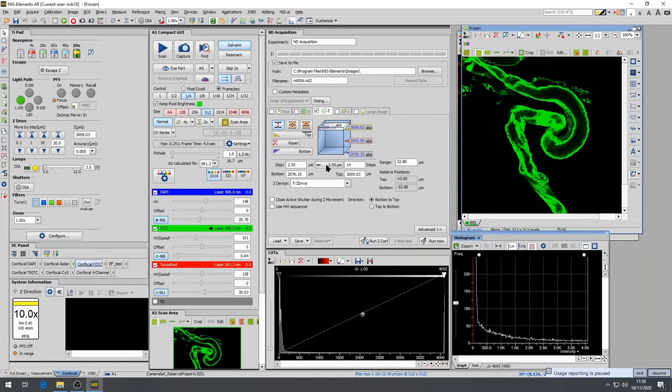Press the Run Now button to start the Z-Stack and a progress bar and an estimated acquisition time indicator should appear.